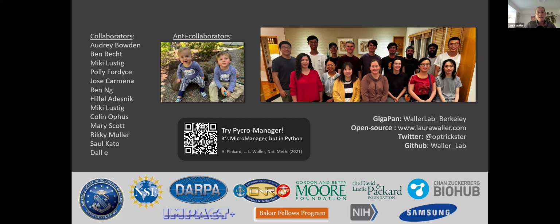Yeah, so it's very ad hoc right now. Yes, you do a new neural network for each type of sample. They might be really similar, but the neural networks are also very opaque, and it's hard to understand what works and what doesn't work. It's not like, oh, I have this insight, I should change this and it will work better in this way. Black magic. There's a lot of just try it and see what works, which is sad for academics. But I can't deny that these things are powerful. And maybe someday we'll figure out better what's exactly going on inside them.